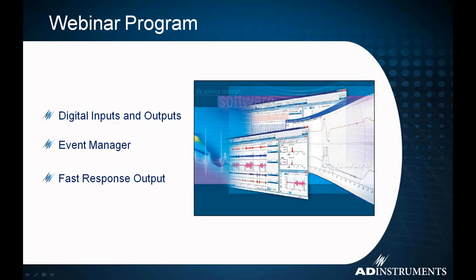Next is Event Manager. This is an extension, so it's free to anybody who owns LabChart, but it is something you'll have to download and install. And then Fast Response Output. That is also an extension. It's free to anybody who's purchased LabChart, but you will, once again, have to download and install it.